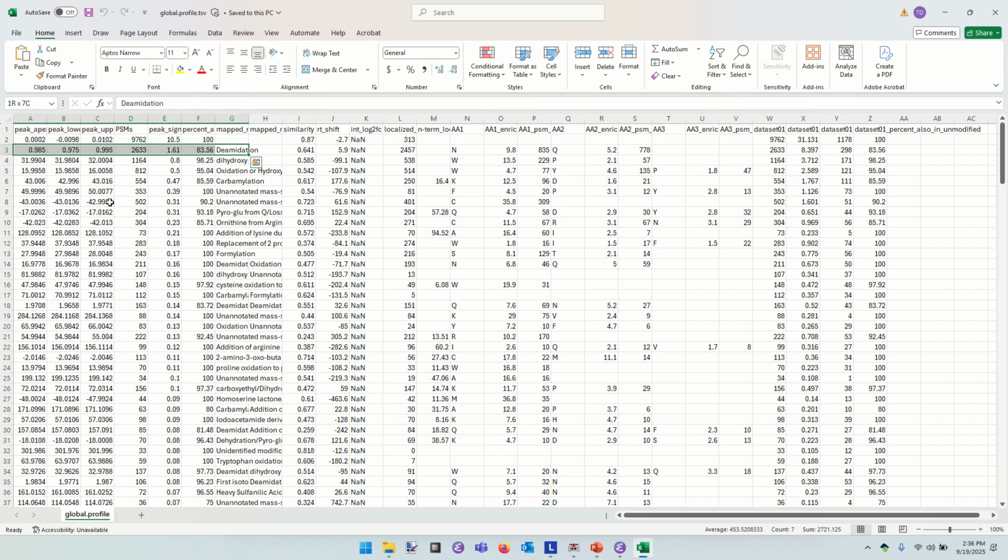And this comes about when you get some weird interactions between the side chain of one of those 2 amino acids and the next peptide bond. In some cases, you can get weird changes of the peptide backbone so that the backbone no longer continues NCC, NCC, NCC. Instead, the rest of the peptide is hooked onto the side chain of asparagine, or of aspartate.